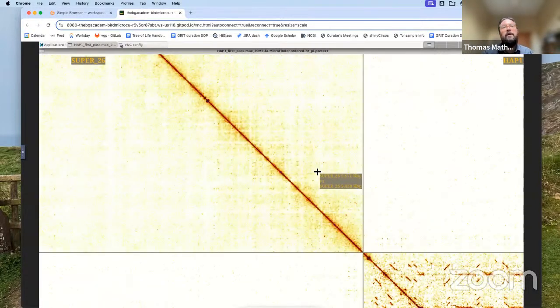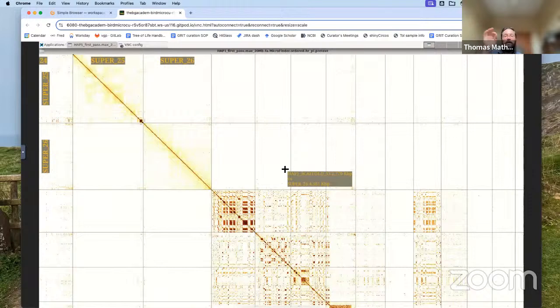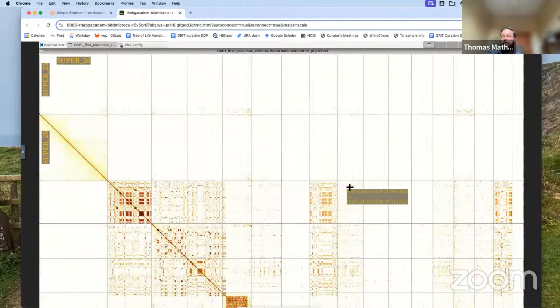And so there is quite a bit of variation from library to library, and I think when you want to zoom in on these very tiny chromosomes, making these higher resolution maps, certainly having more Hi-C coverage will be beneficial. So I would aim for at least 50x. I can't remember what the Genome Arc ones aim for. It might be more than 50x. I don't know if you know, Joe or Dom, but I think they typically do slightly higher coverage than the Sanger birds. But certainly I would say minimum of 50x, and more the better for this method. Again, because we've only just started playing about with it, we haven't done anything systematic yet to say what you would exactly need to be able to do it. But certainly the more the better, I would say.